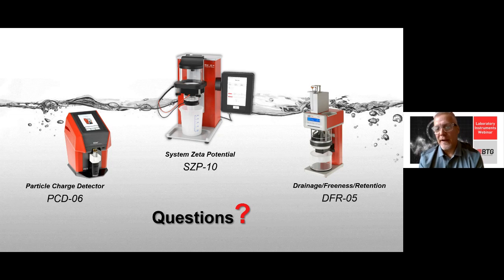That's a good question, Manfred. I know that there's shear created with the propeller blades, and I believe they'd probably be looking for a pulsing type vacuum shear that's been used to simulate foil boxes. Maybe you can talk about some of the available options, because those things can be valuable.